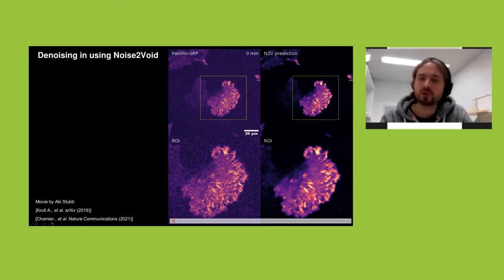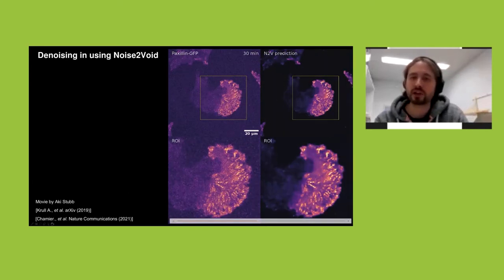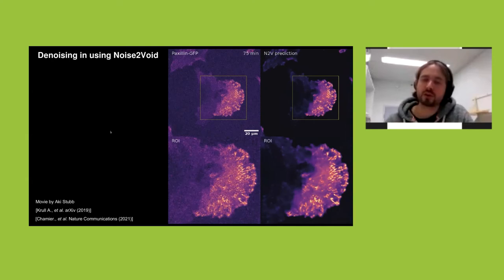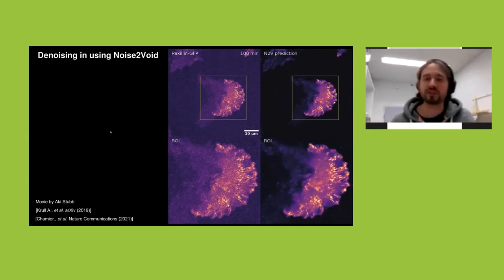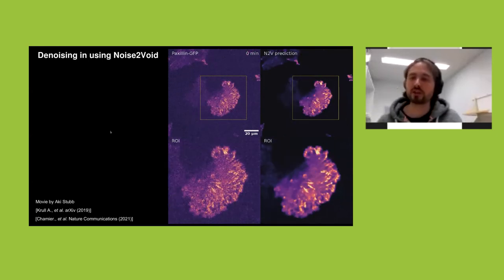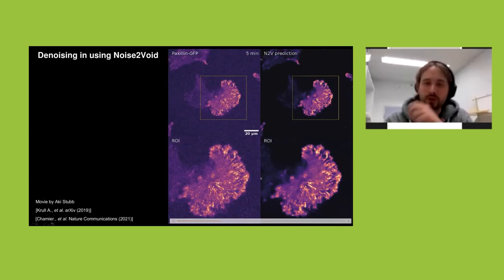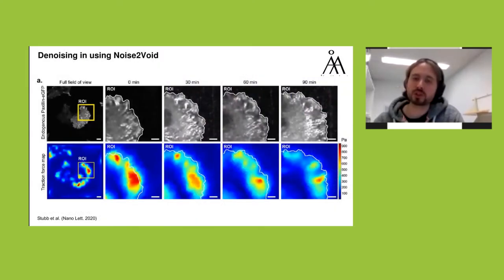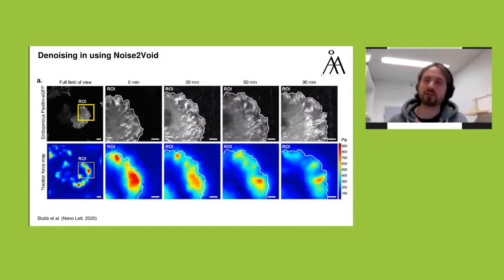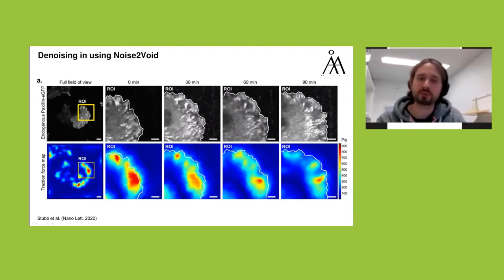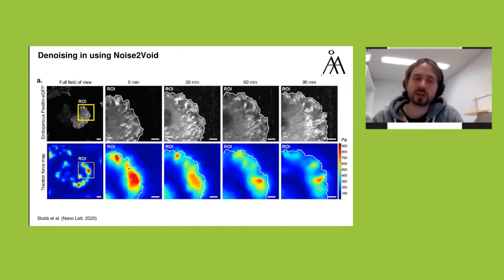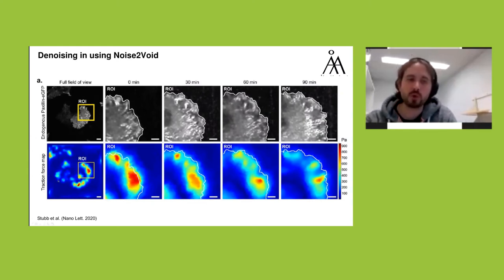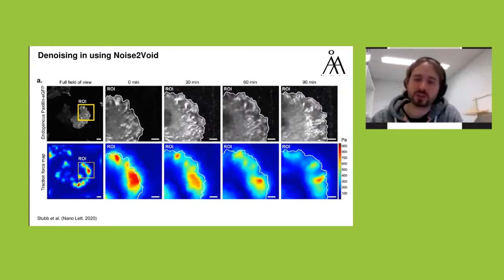Here is an example of using Noise2Void to denoise migrating cells: glioma cells labeled for endogenous Paxillin, plated on polyacrylamide gels of defined stiffness to study how stiffness affects migration capability. By using this denoising approach we were able to much better resolve focal adhesion structures. We then correlated how those focal adhesions match the forces exerted on the substrate using super-resolution traction force microscopy. This was published last year.